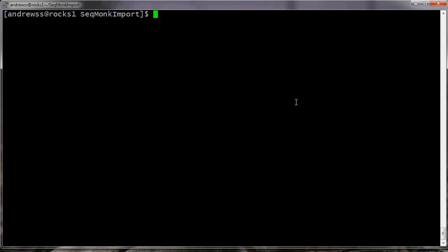So to try and make this process smoother, we've written a command line importer for SeqMonk project files, which allows you to take a set of BAM files, create a single more compact SeqMonk project file, and then all you need to do is to transfer that single file to your local machine to start working with your data. The large files can then stay on your remote system and never need to transfer.